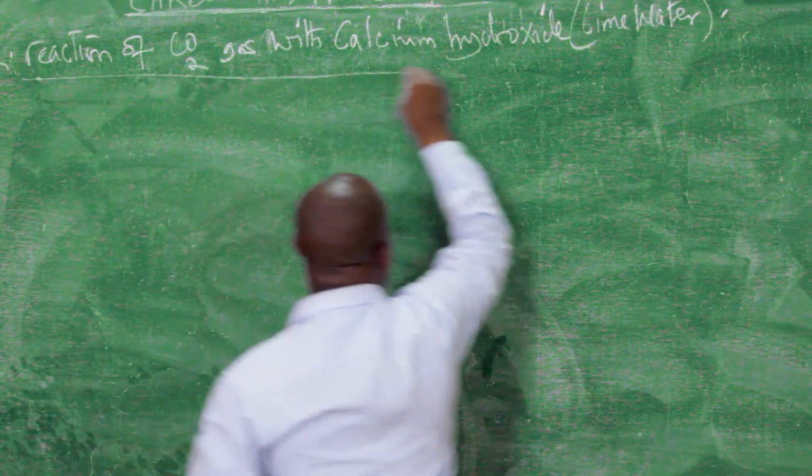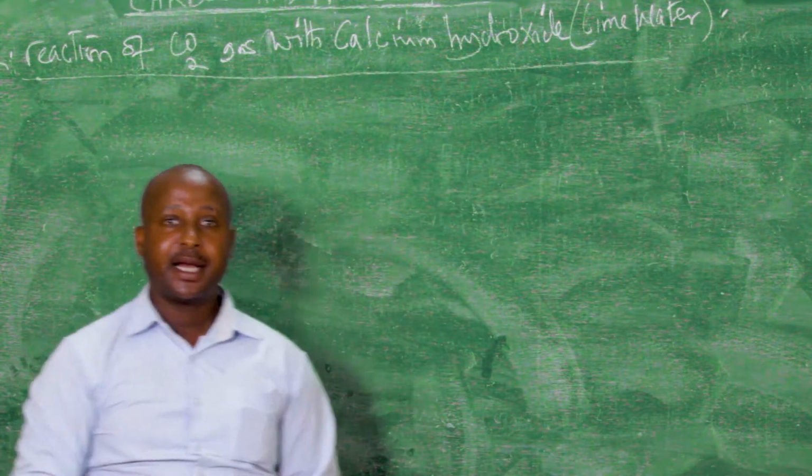Let's discover this interesting chemical reaction.